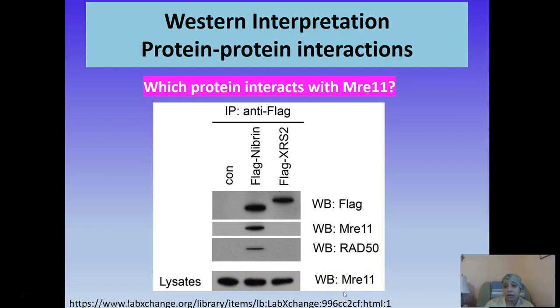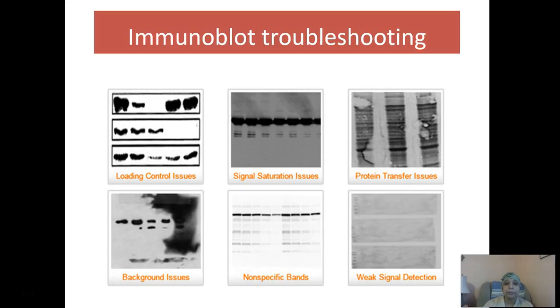All of them started out with the same amount of MRE11, but only Nibrin immunoprecipitation led to pulling down of MRE11 as well, not XRS2. And then we look at another protein that might be interacting with them and see that difference as well.